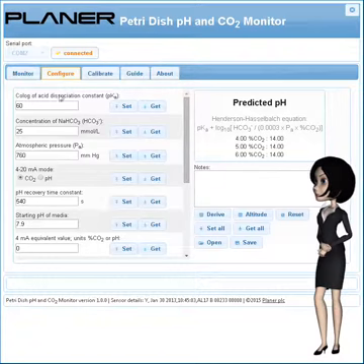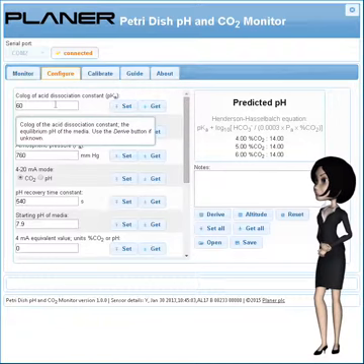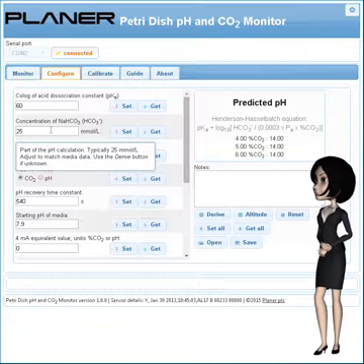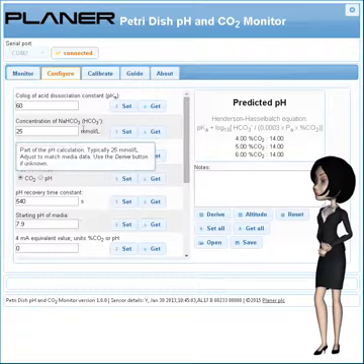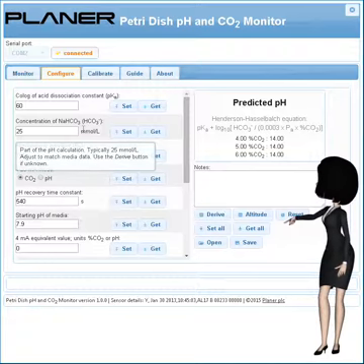It's here that you need to enter values specific to the media you're using. A couple of these — the acid dissociation constant and the bicarbonate concentration — might be tricky to find, but we can fix that by using the Derive button.